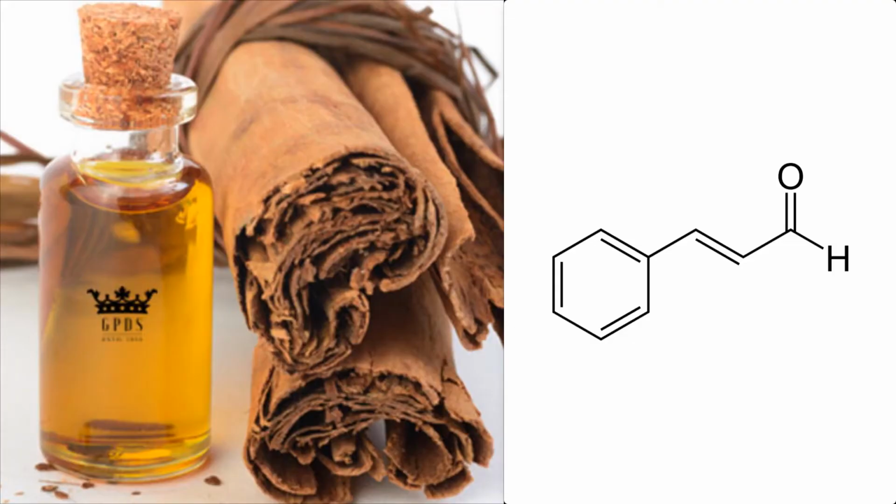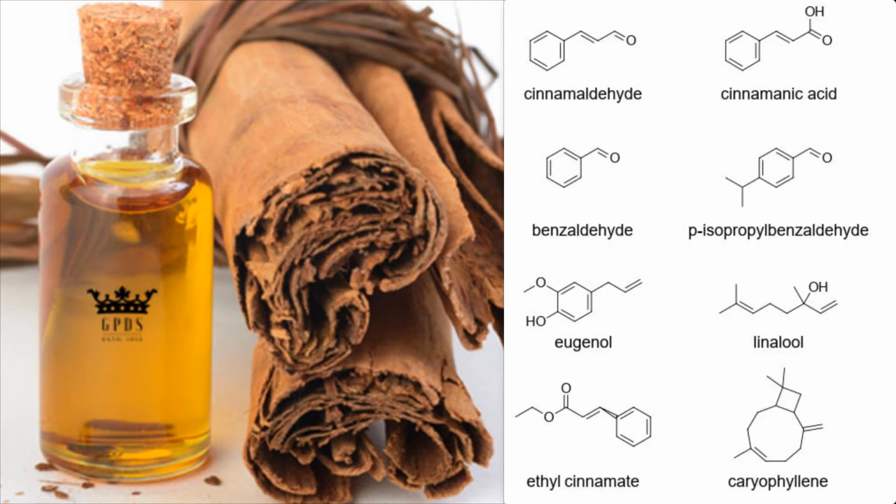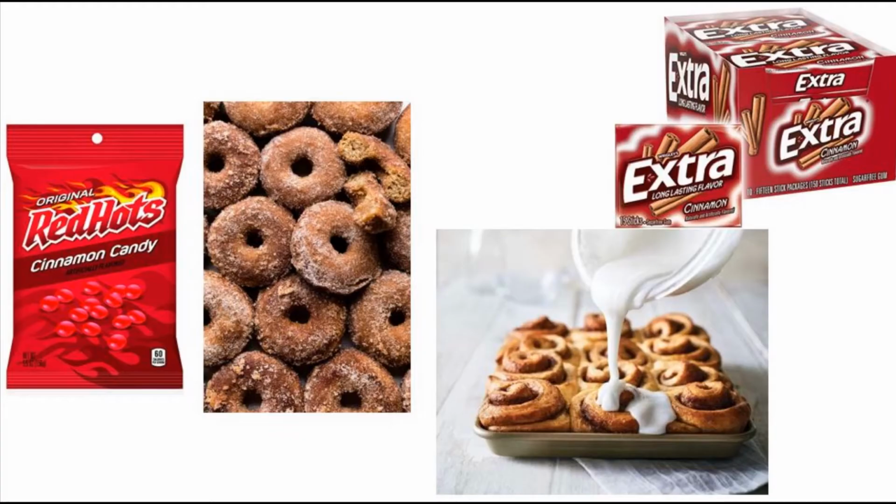You have very likely heard of cinnamon. True cinnamon comes from cinnamon bark, which contains mostly cinnamaldehyde, but also contains other flavor components including benzaldehyde and para-isopropylbenzaldehyde. Cinnamaldehyde is used to flavor candies, gum, and baked goods.